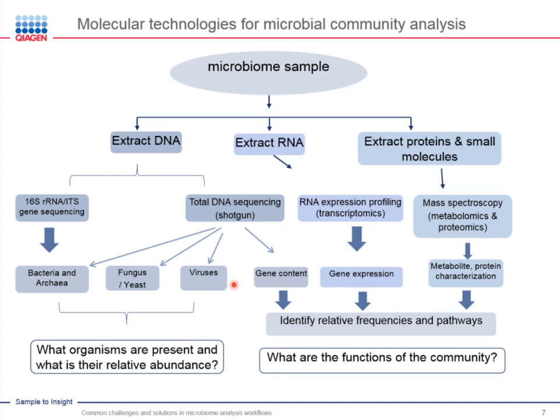This leads in the end to the need for a high sequencing capacity per sample. So you have to do really high coverage sequencing. You have a lot of data because you do not just have a short amplicon, you sequence entire genes, entire genomes. It gives you a lot of additional information, but sometimes you just want to know the distribution of different strains.